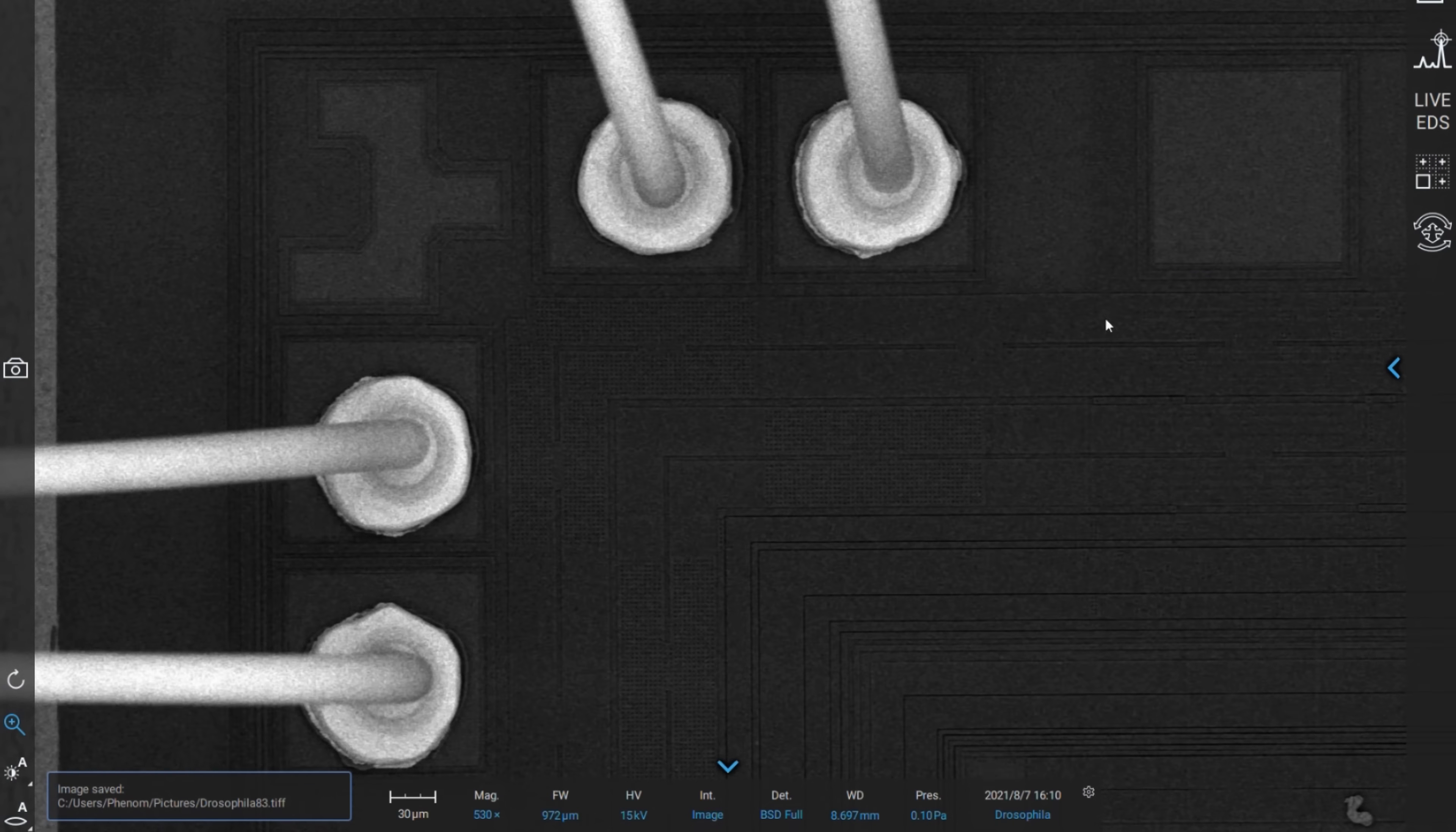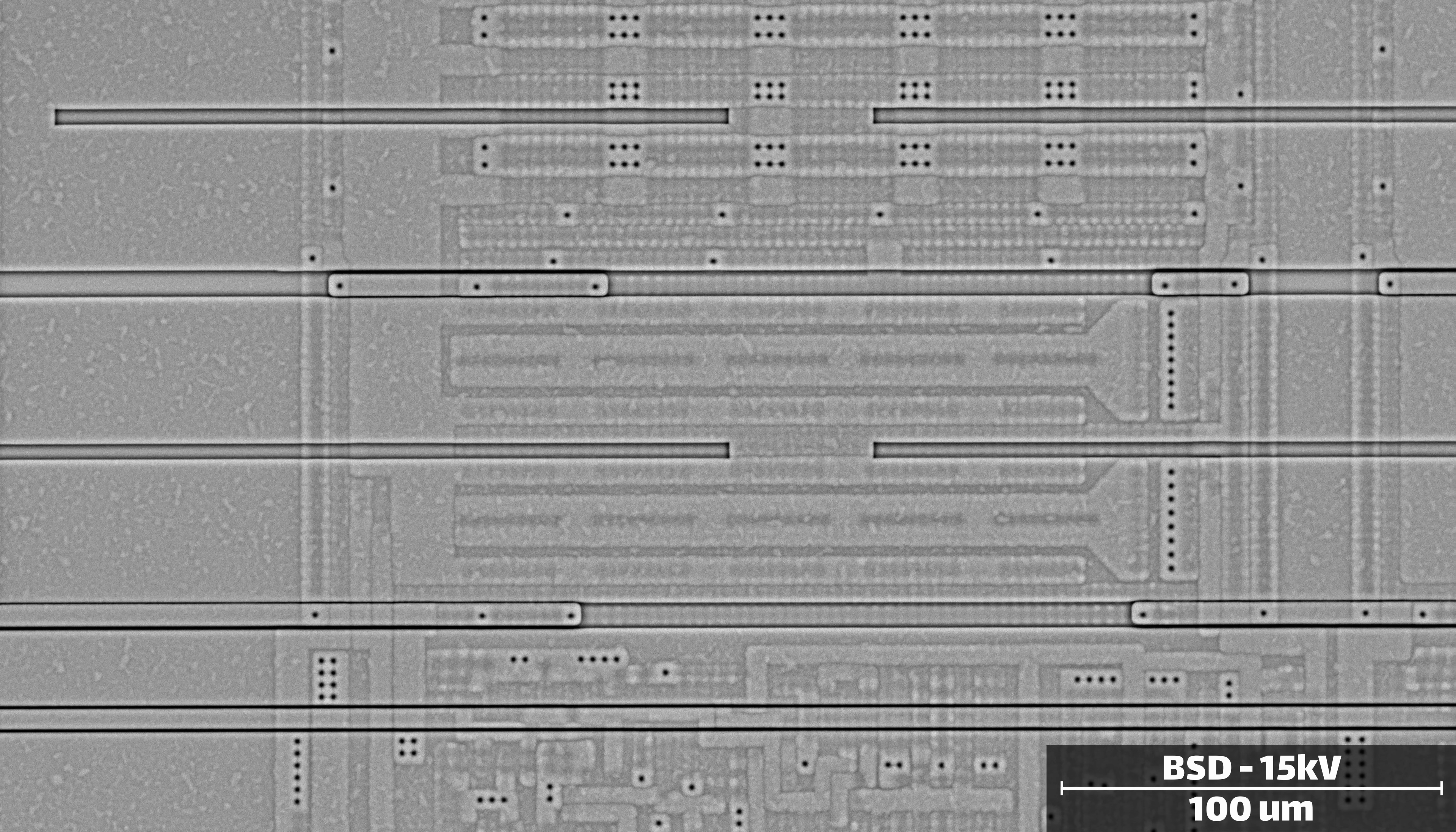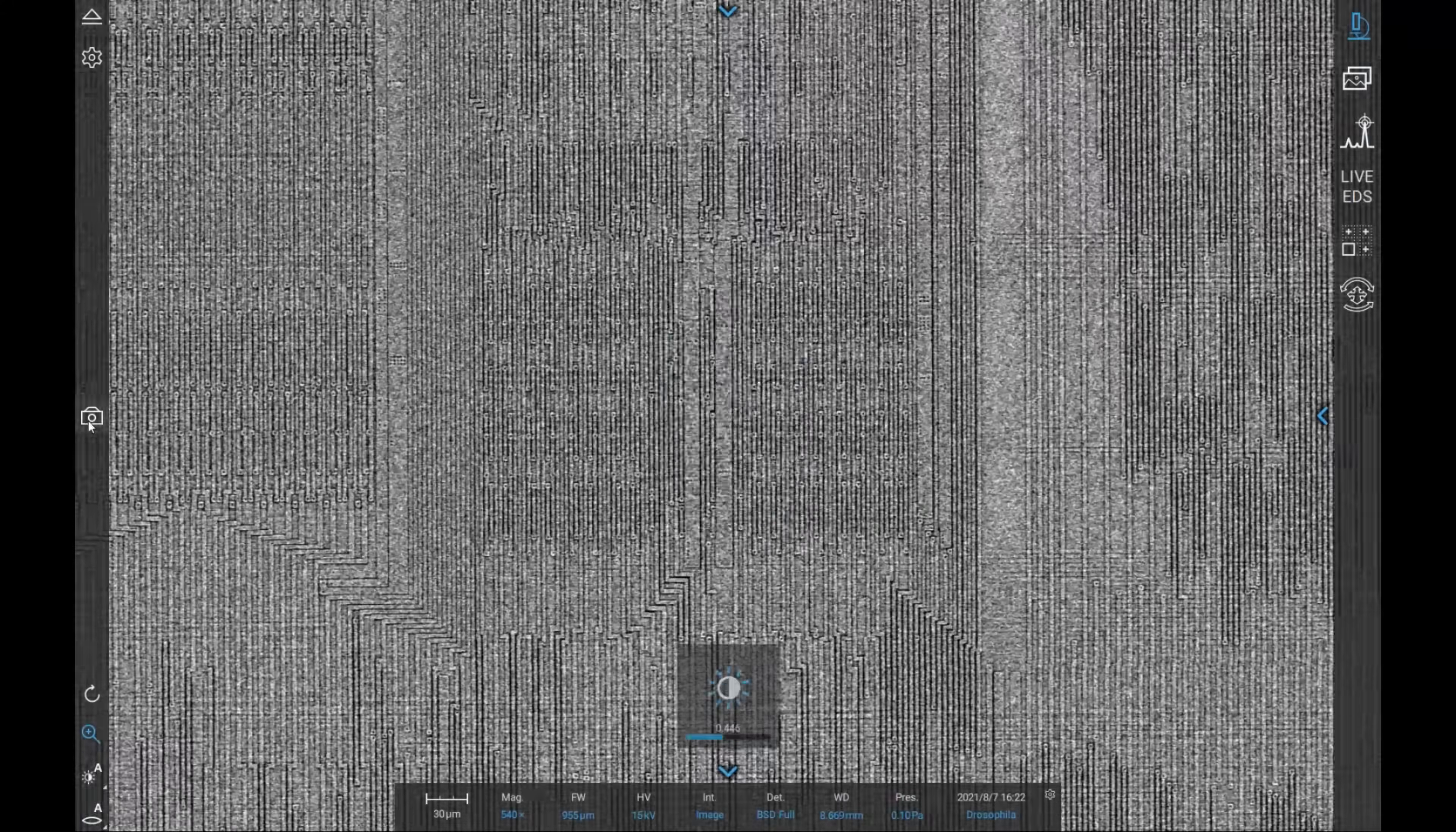We can switch to a different detector on the scanning electron microscope that allows us to peer beneath the surface a little better. This allows us to see and map the underlying layers in better detail. The 486 only has a handful of layers, but modern CPUs might have dozens stacked on top of each other.